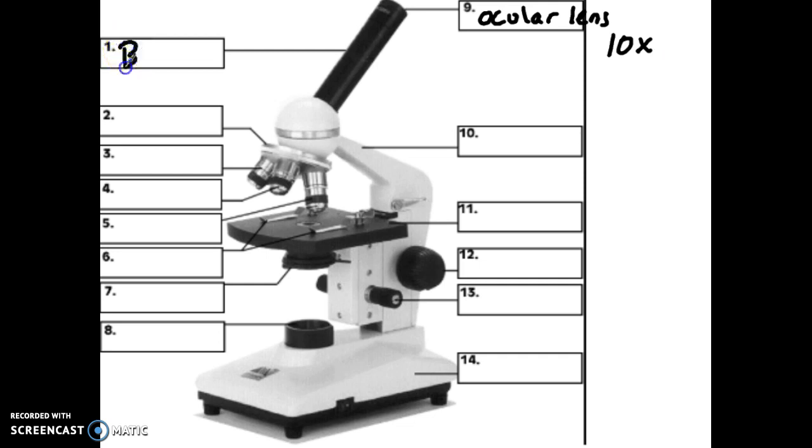Number one over here is the body tube. I don't necessarily know the function. It has to have a distance, I'm sure, between the two lenses for this to work. And the body tube just allows that distance to occur.